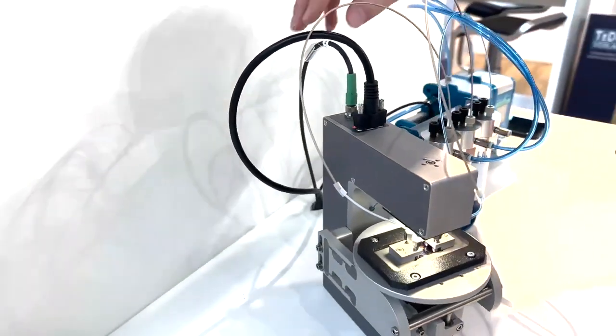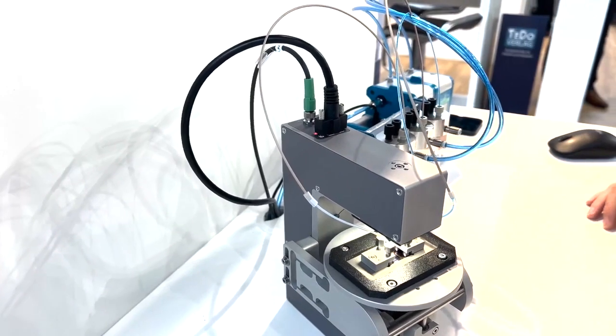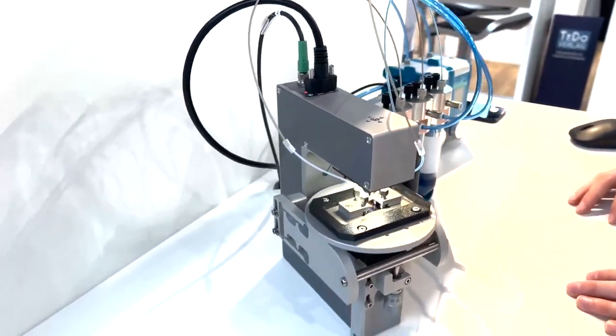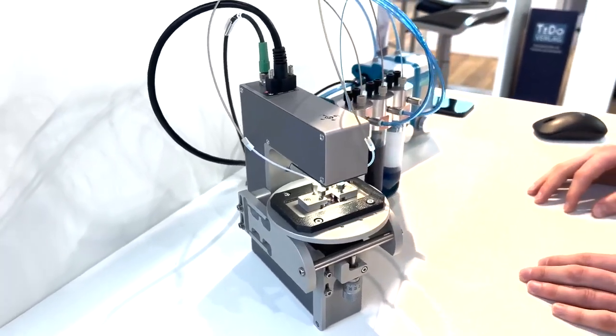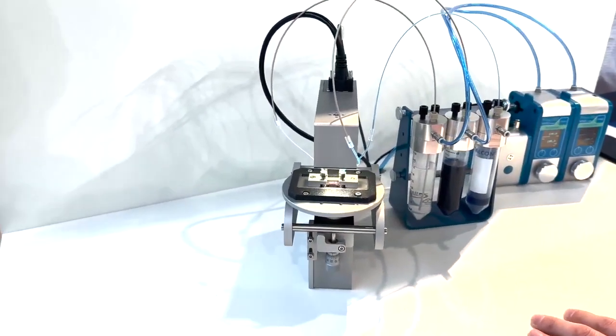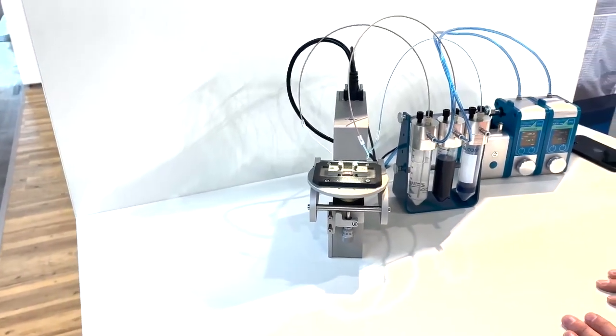The imaging profile M is available in different versions and therefore customizable. The modules are available with 5, 10 and 20x magnification. Furthermore, different light sources and wavelengths as well as fluorescence light sources are possible.